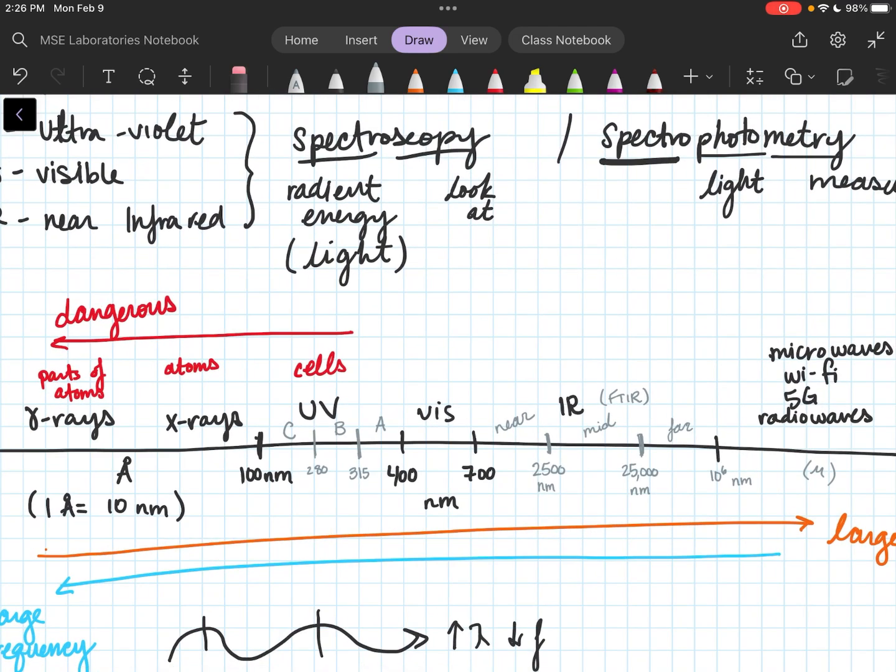For the sake of today, a UV-Vis typically is going to go from mid-range through the C up through near IR. I will just fill that in there. So this right here is a UV-Vis-NIR, an instrument. It's going to cover that range of wavelengths.